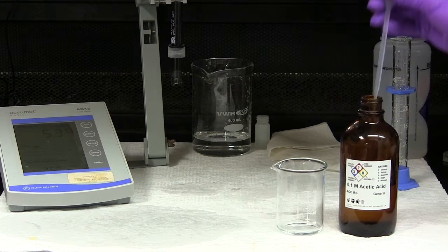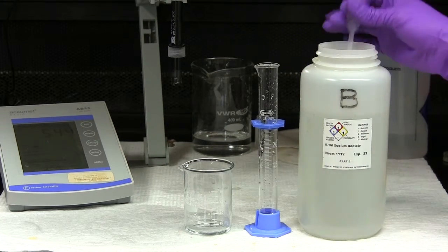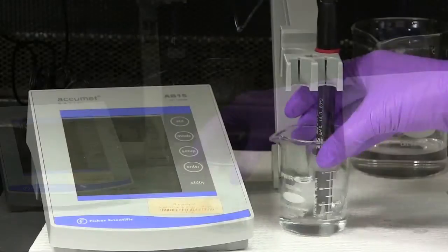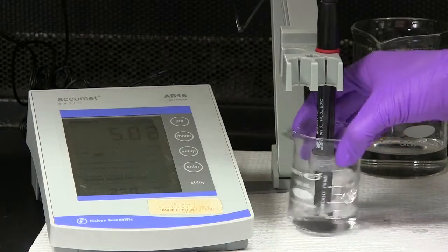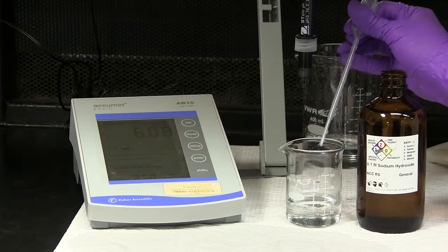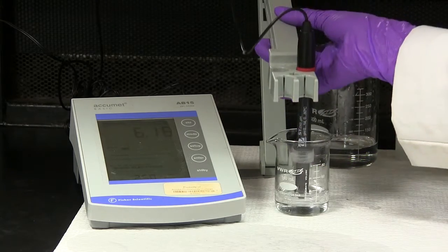Make a buffer mixture containing 2 milliliters of the acid component and add 20 milliliters of the solution containing the conjugate base. Mix and measure the pH. Calculate a third value for the pKa. To that solution, add 3 milliliters of 0.1 molar NaOH. Measure the pH. Explain the results.